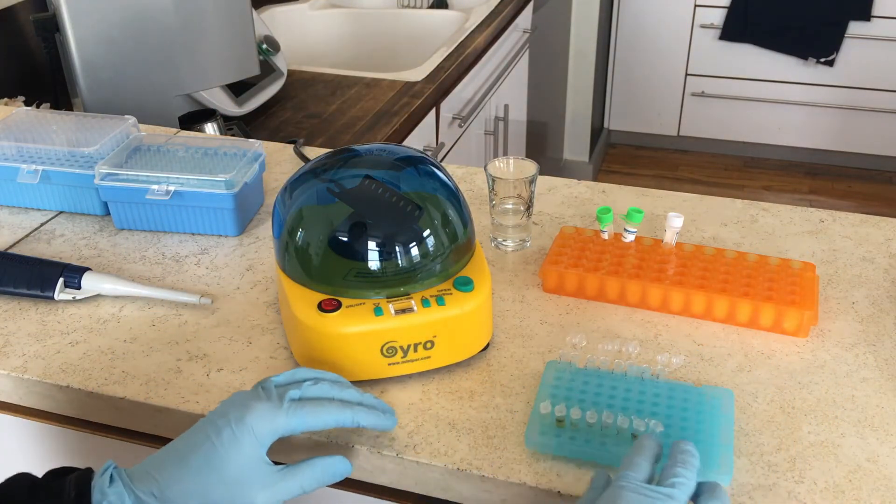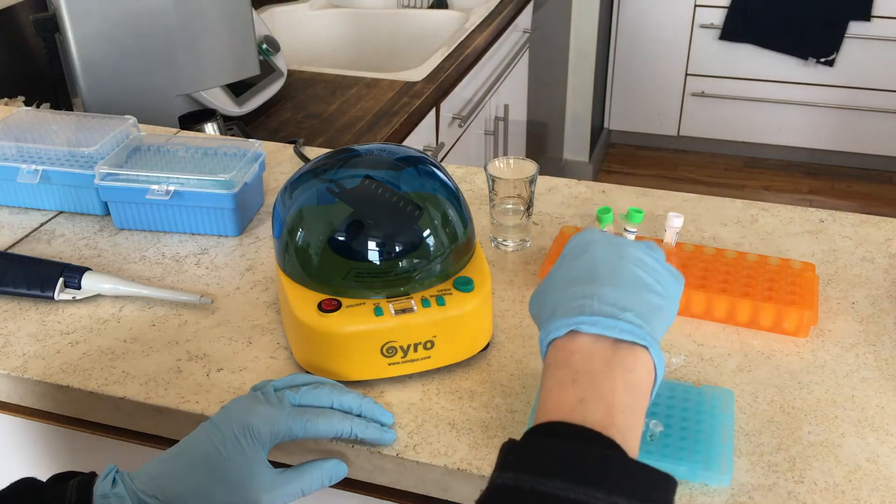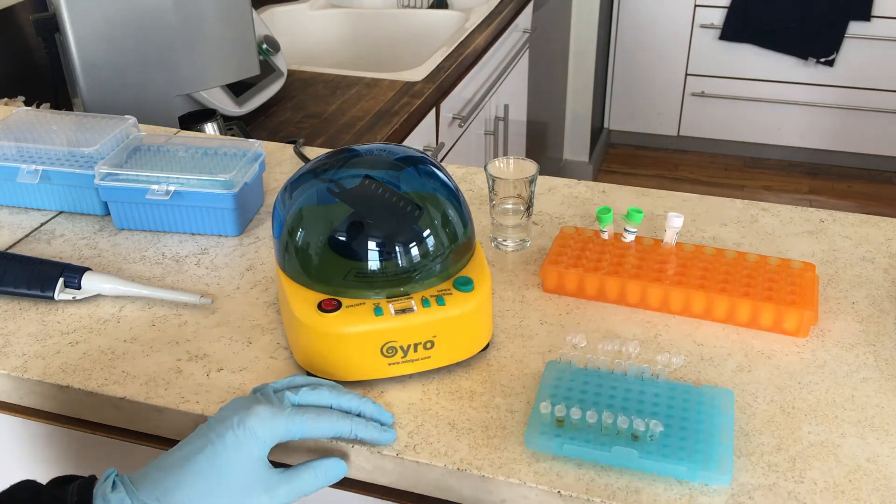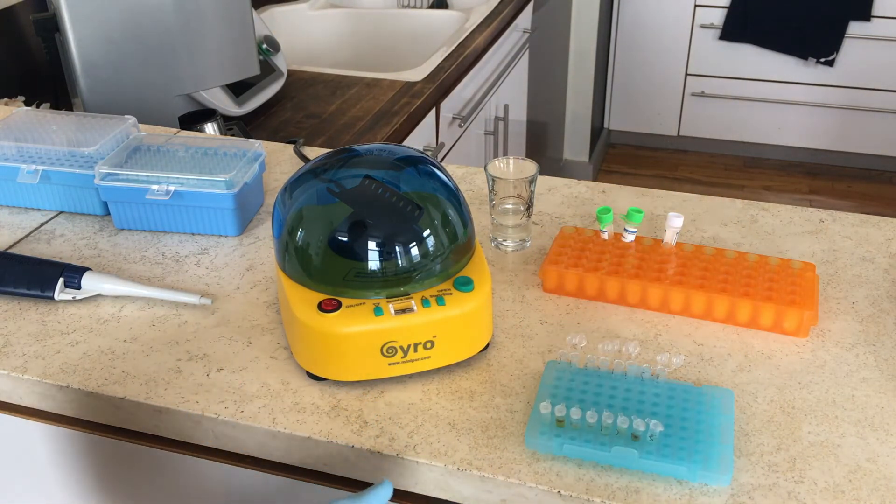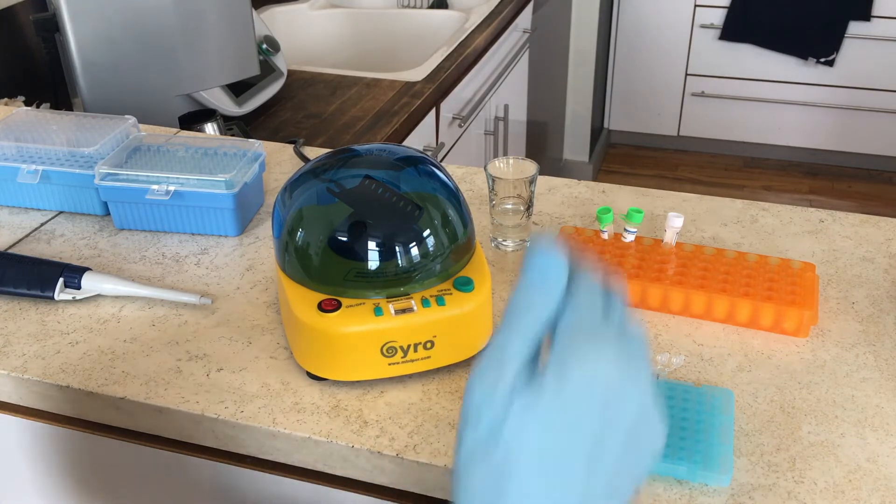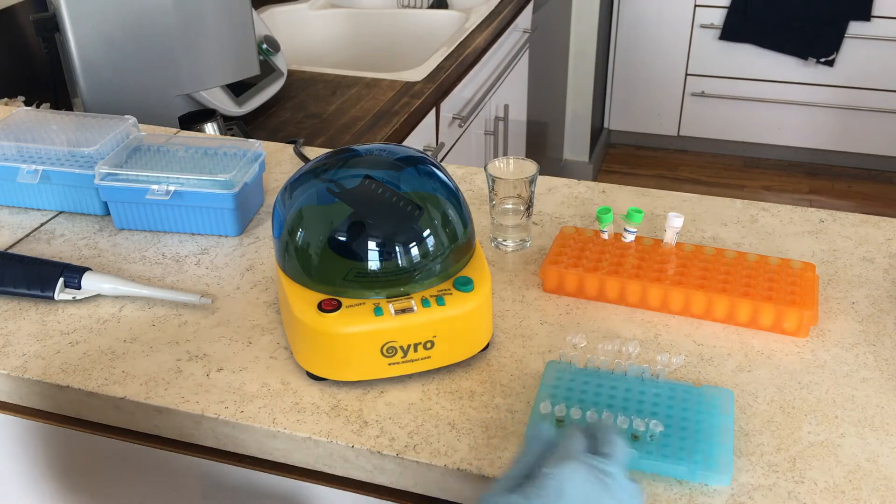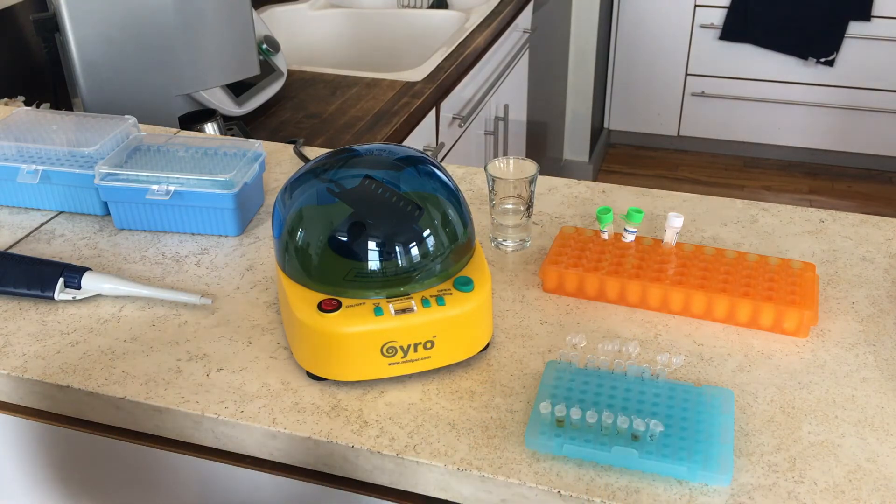You're going to take one microliter and put it in the new tubes in the back that have the master mix and fungal primer in them. And you're going to have to use a new pipette tip for every transaction because obviously there's fungal DNA in here and you don't want to mix it up between the different samples.